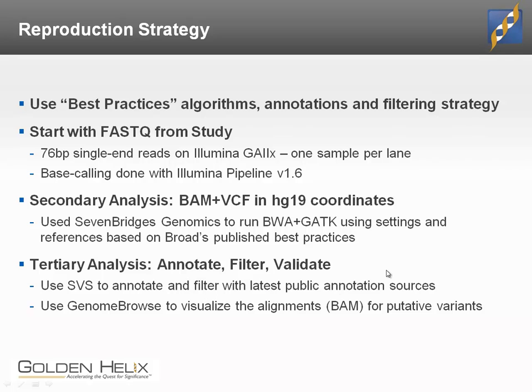And finally, when we get to a list of interesting variants or a candidate variant we want to investigate, and really I recommend this for anybody who's doing research on next generation sequencing, don't stop at just looking at a spreadsheet or a list of variants. Always go back to the alignment data.